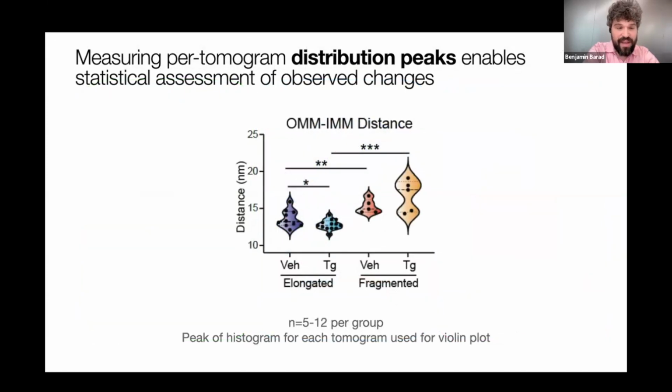And it's great that we can do these local visualizations. We gain a lot from that. We can also aggregate that information and compare across many tomograms and then really have robust ways to do statistical analysis. So this is really the figure that convinces me that this is actually a cell biology tool now, that we can do good statistics using these segmentations and quantifications and do it with a lot of confidence.